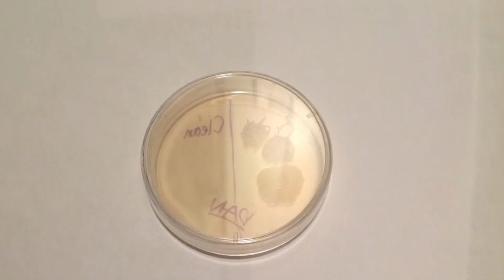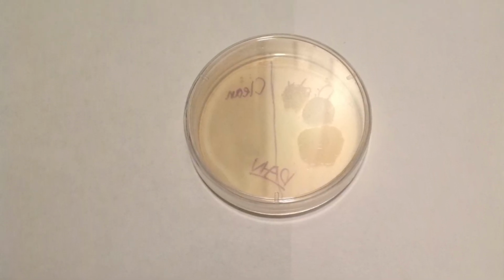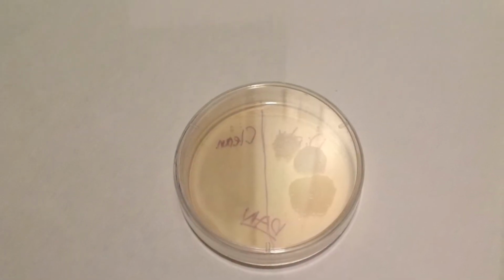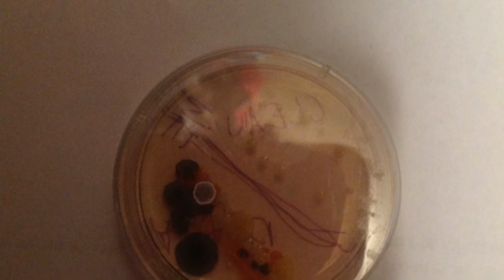But there were instances, and there were quite a few of them, where there was still some bacteria on the clean side, which does worry me a bit, but I am happy that they were mostly cleaner on the clean side. For example, in this picture, there were only 3 colonies on the dirty side, and most importantly, there were none on the clean side. But the following petri dish really shocked me because there were many colonies on the dirty and on the clean side. So you will see it right now.